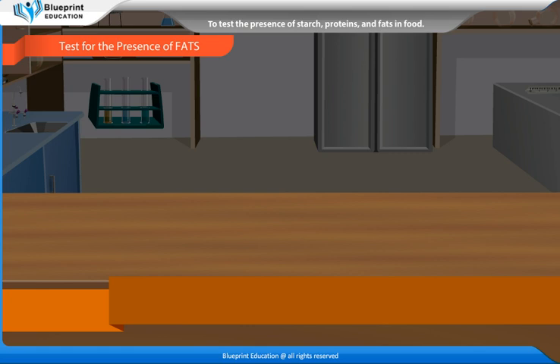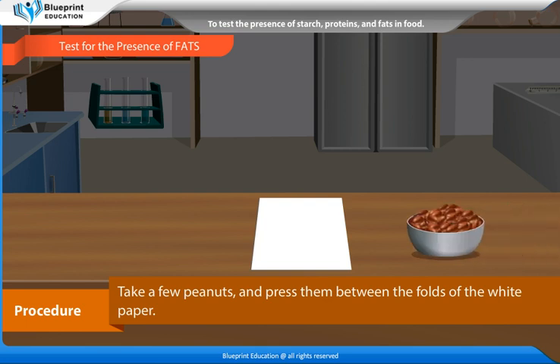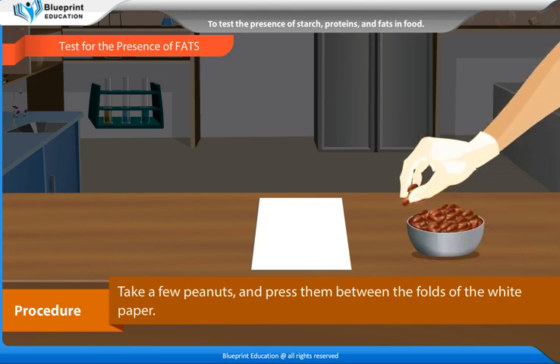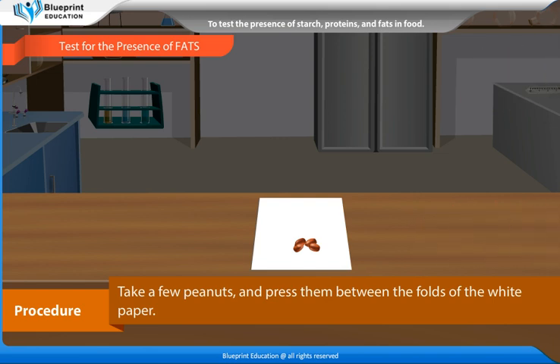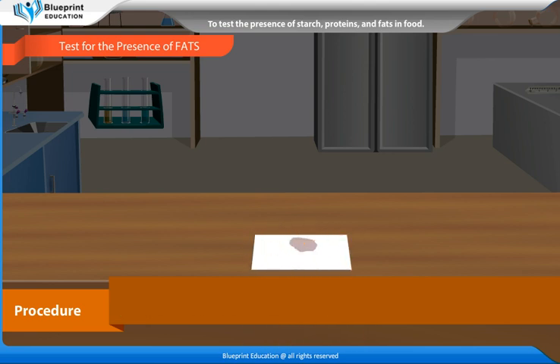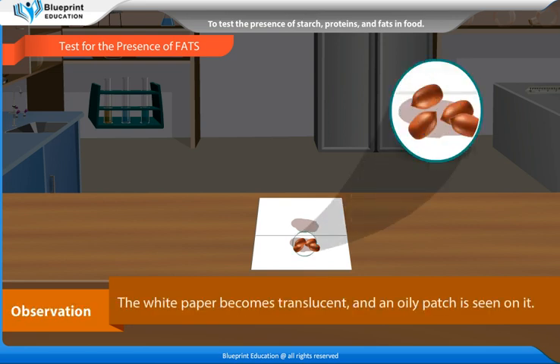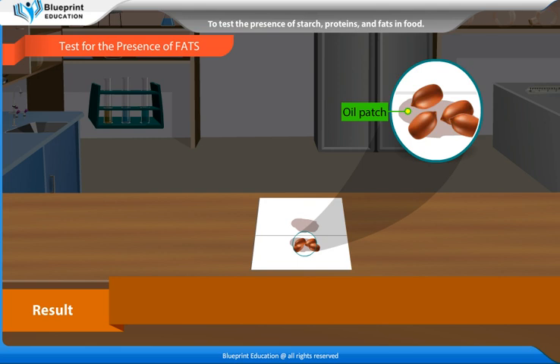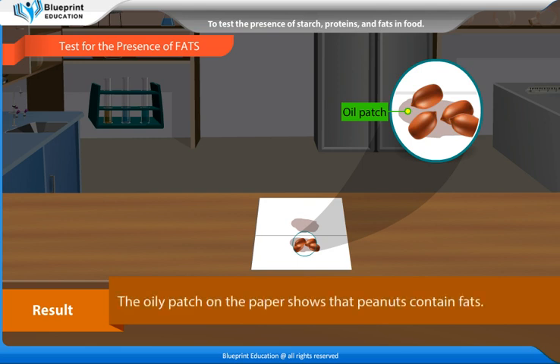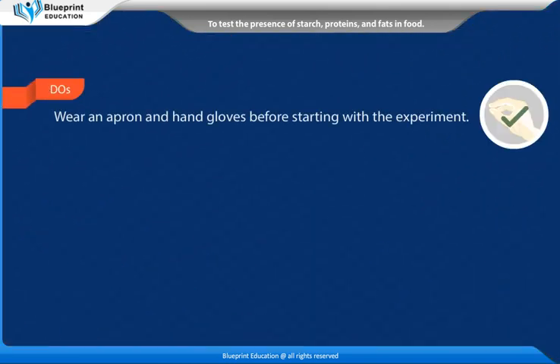Test for the presence of fats. Procedure: Take a white paper, then take a few peanuts and press them between the folds of the white paper. Let the white paper dry for a while. Observation: The white paper becomes translucent and an oily patch is seen on it. Result: The oily patch on the paper shows that peanuts contain fats.